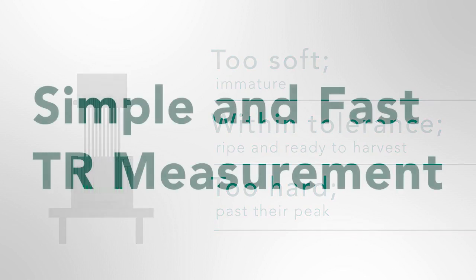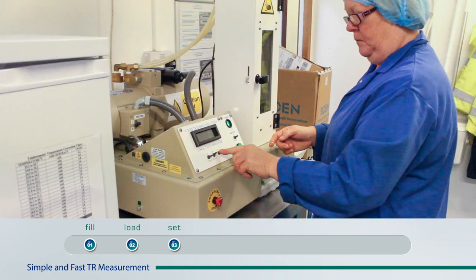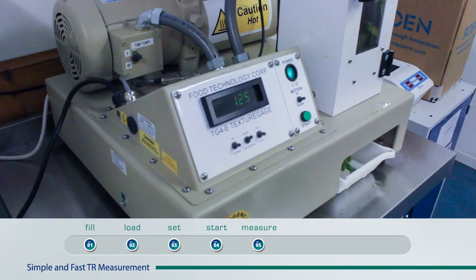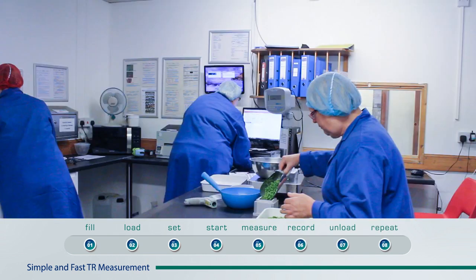Simple and fast pea grading: fill, load, set, start, measure, record, unload and repeat.